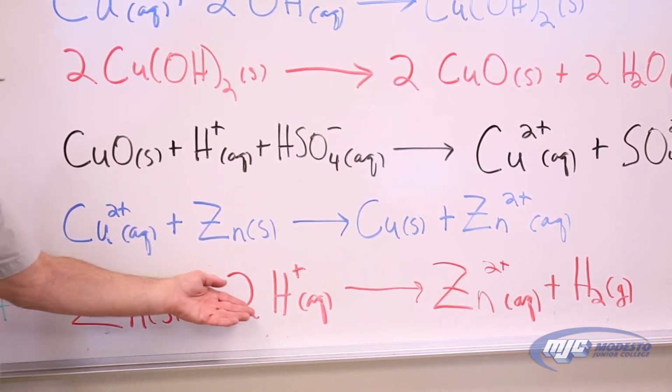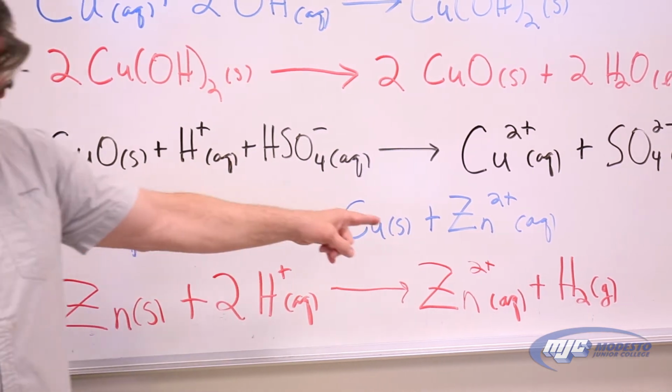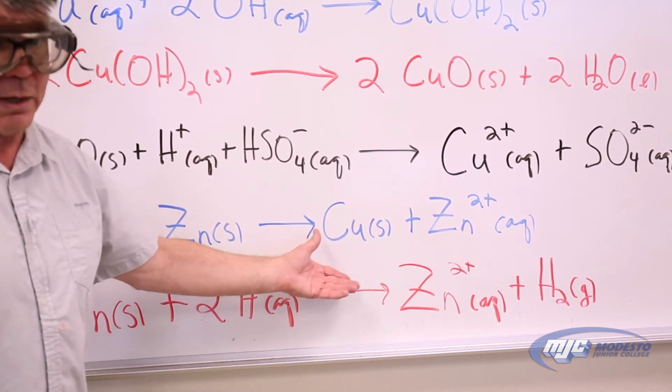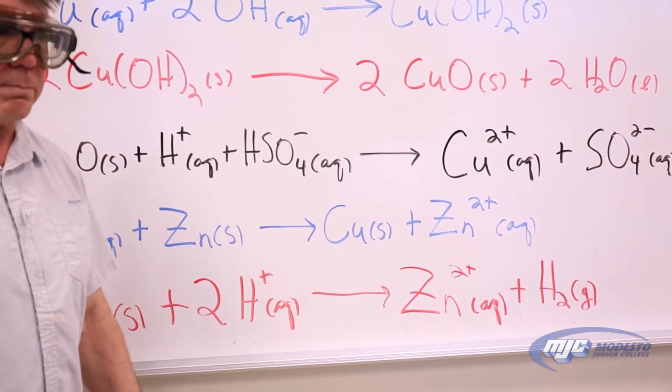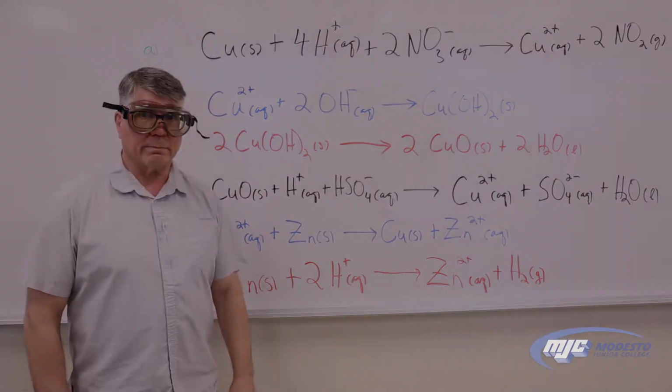So we're going to take some hydrochloric acid and just dissolve that zinc metal. And we're going to get hydrogen gas off at the end. We're going to have to do this in the hood too, because hydrogen gas is flammable. That's what we're doing, so why don't we go over and get started on that reaction.